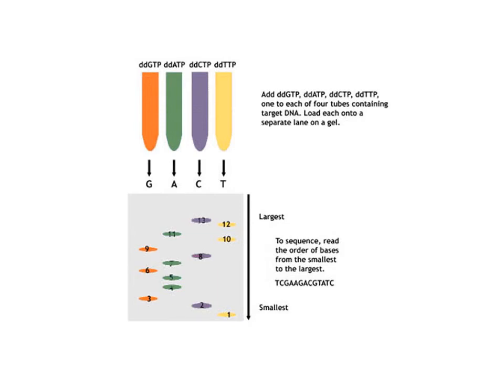In order to figure out which one goes where, you simply run it on an agarose gel. The same way we did in lab, what we've talked about in lecture and in the lab video. Remember that the smallest fragments move the fastest. So in this case, the dideoxy TTP reaction generated the very smallest fragment. So you know the very first base is T. Move up one, and you've got yourself a C. And then a G, and an A, and an A, and another G, and an A, and a C, and a G, and all the way back over to T, and then it looks like an A, and a T, and a C, and you'll notice that's the sequence of your unknown.